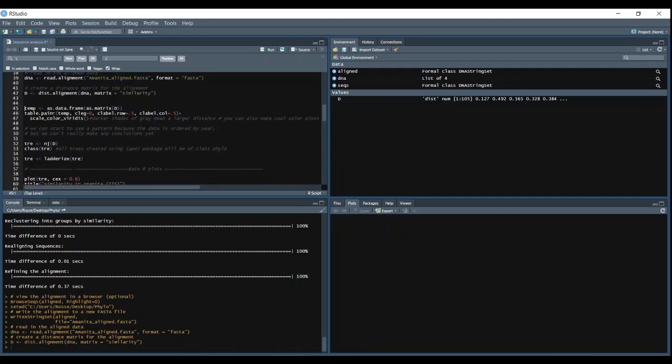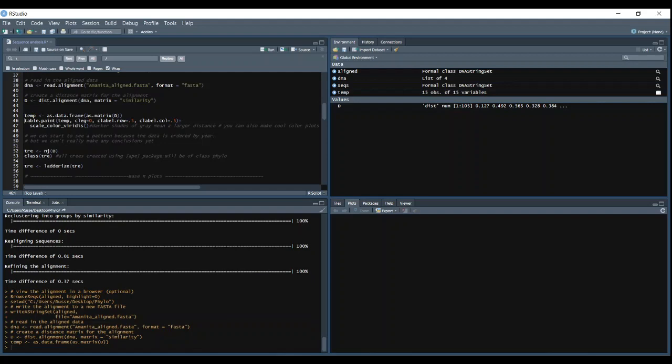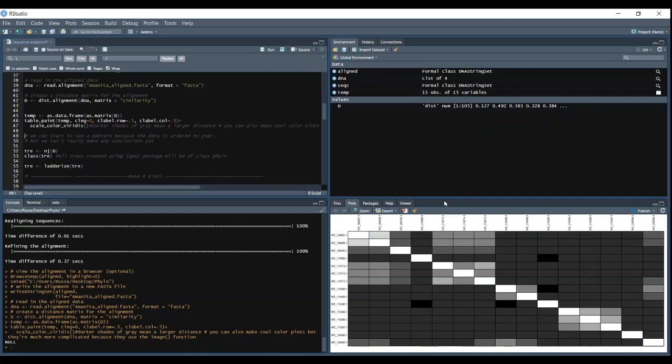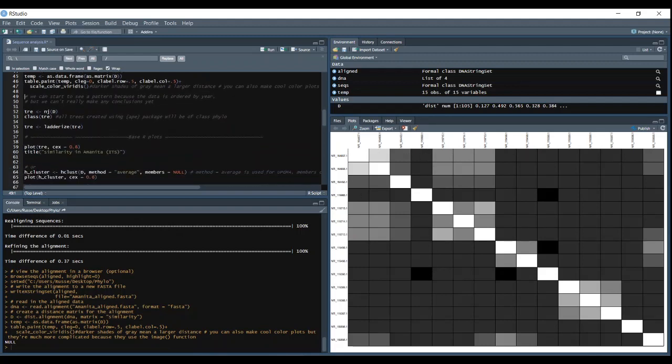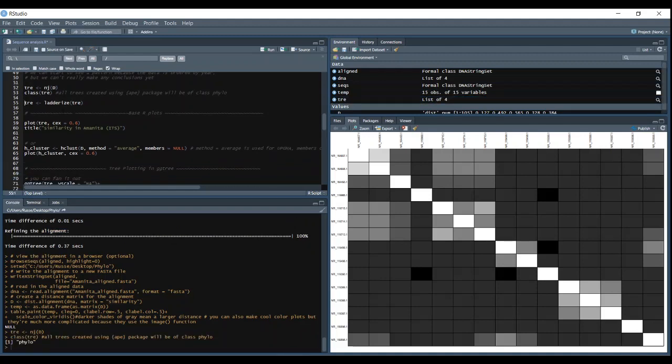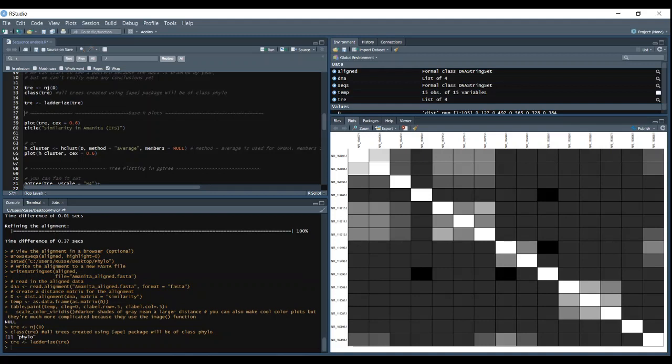And then we can turn our distance matrix into a data frame and run table paint. So basically what this does is it shows darker values as more distant sequences and then lighter values as closer sequences. You can see on our x and y axis there's a table of our sequences and then how far or close they are to each other. And then we can start making our tree. So we use the nj function for our distance matrix class tree to turn it into a phylo object. And then we ladderize based on our distance matrix phylo object data.